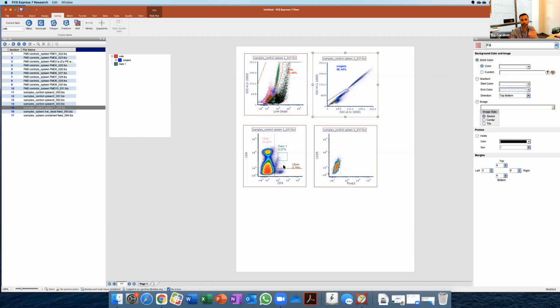And you would have to explain, no, these are the granulocytes, or the monocytes, forget it. So it's a nice way of eliminating, gating out those populations as you're going along. Again, as long as you know what you're doing and you're gating them appropriately with the right controls.